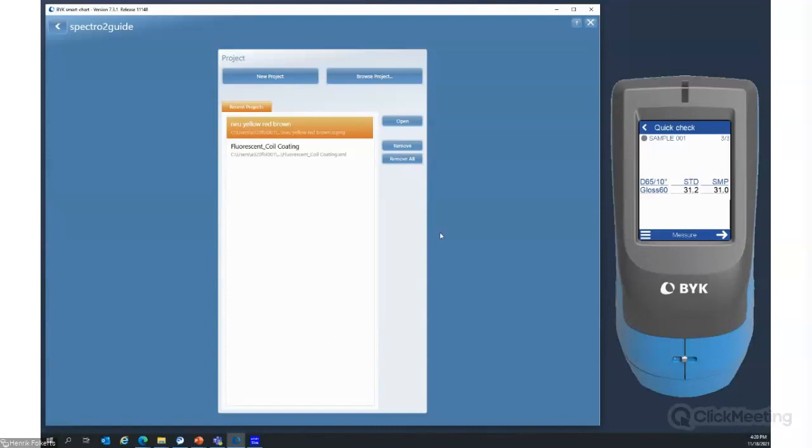This depends on how you want to organize those files, and then you can store them where you want. That is a free concept, just in files. And if you want, you can transfer this from the files into a database. But in the first step, it's only in files.